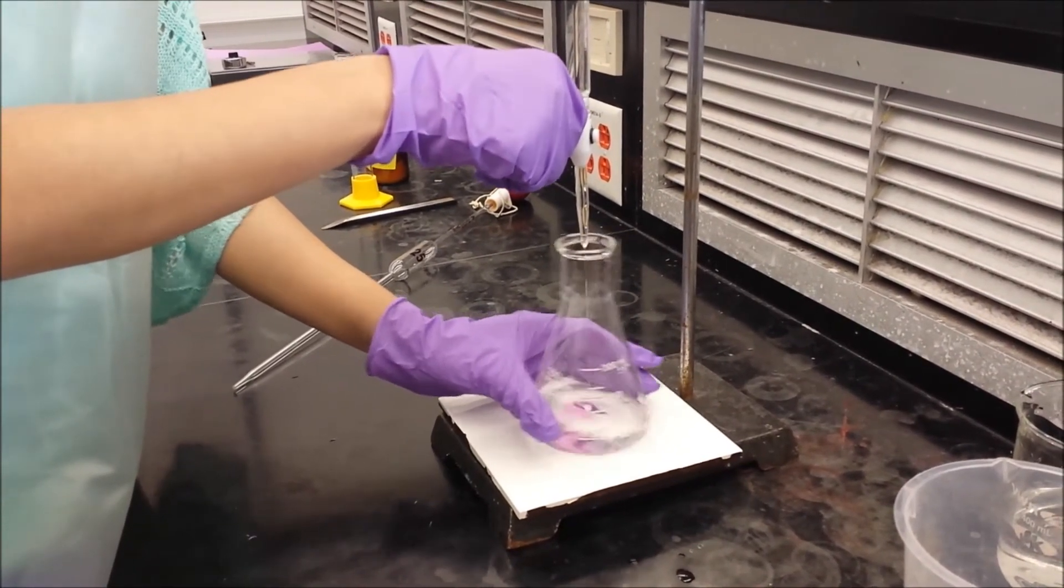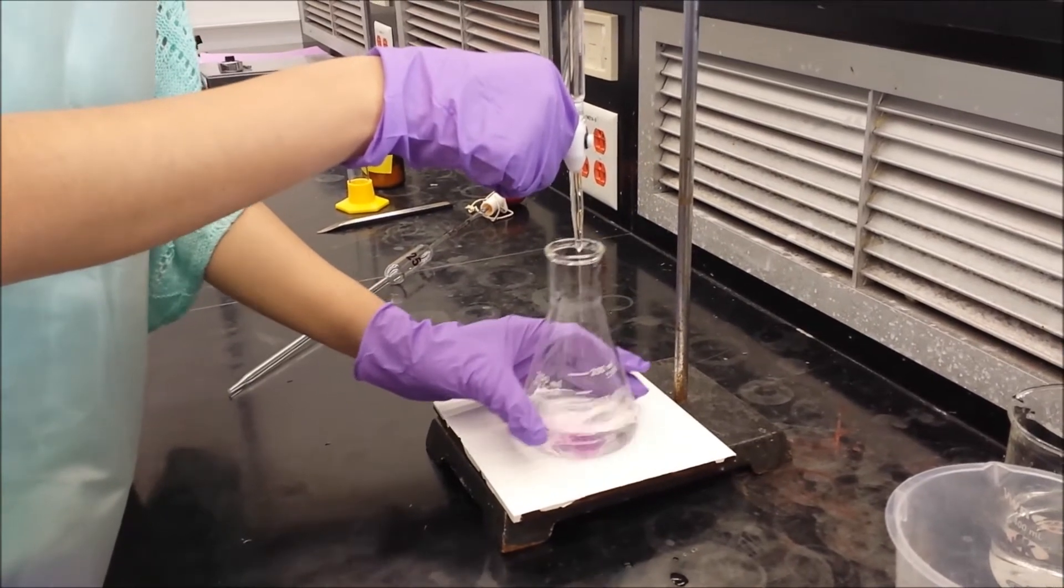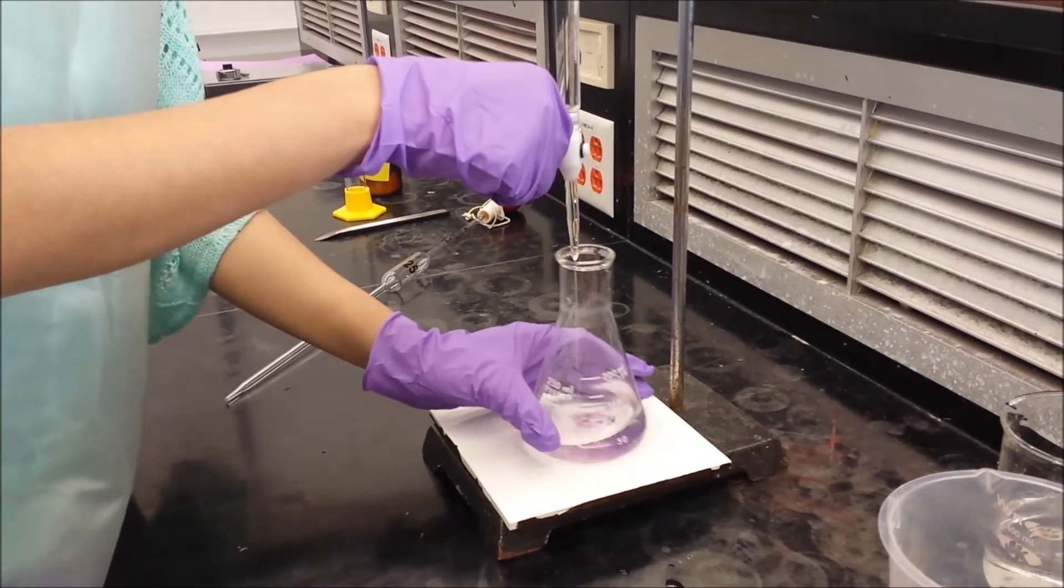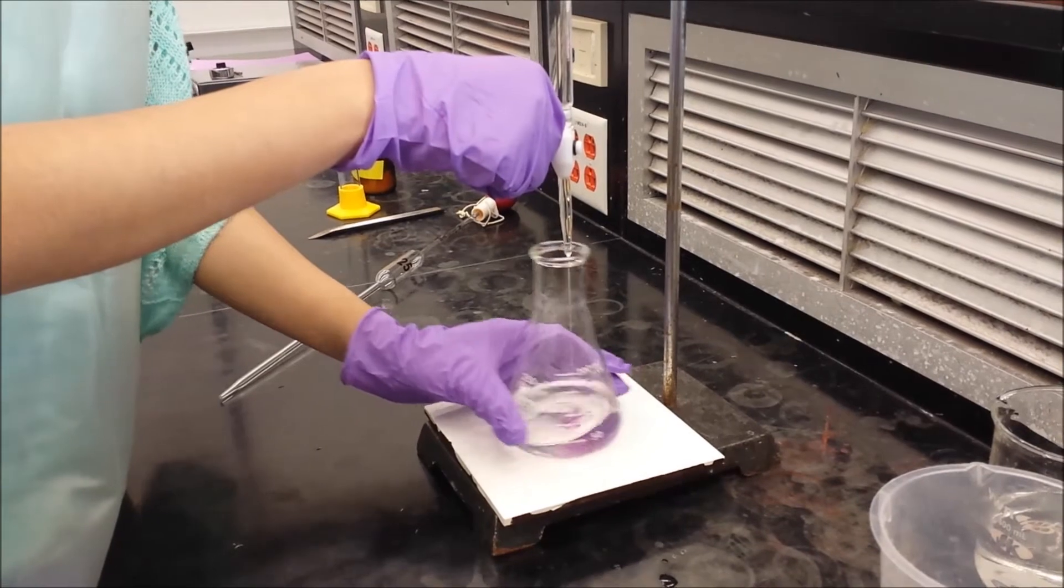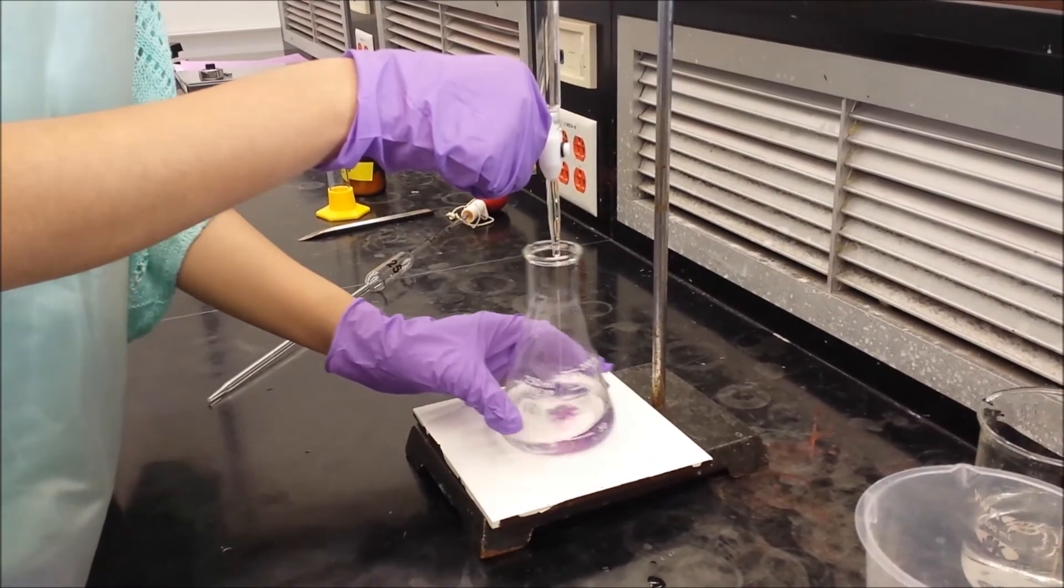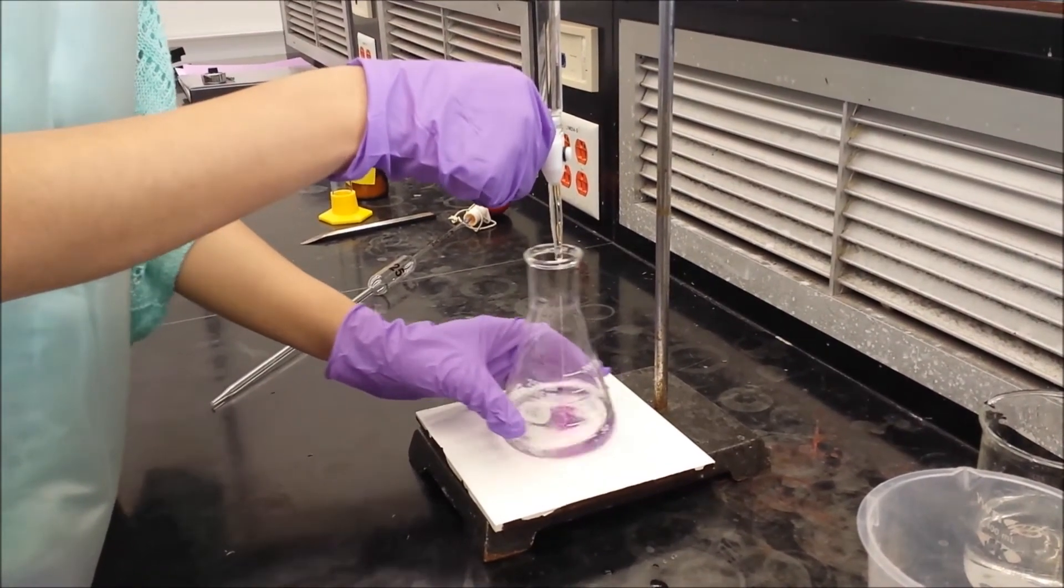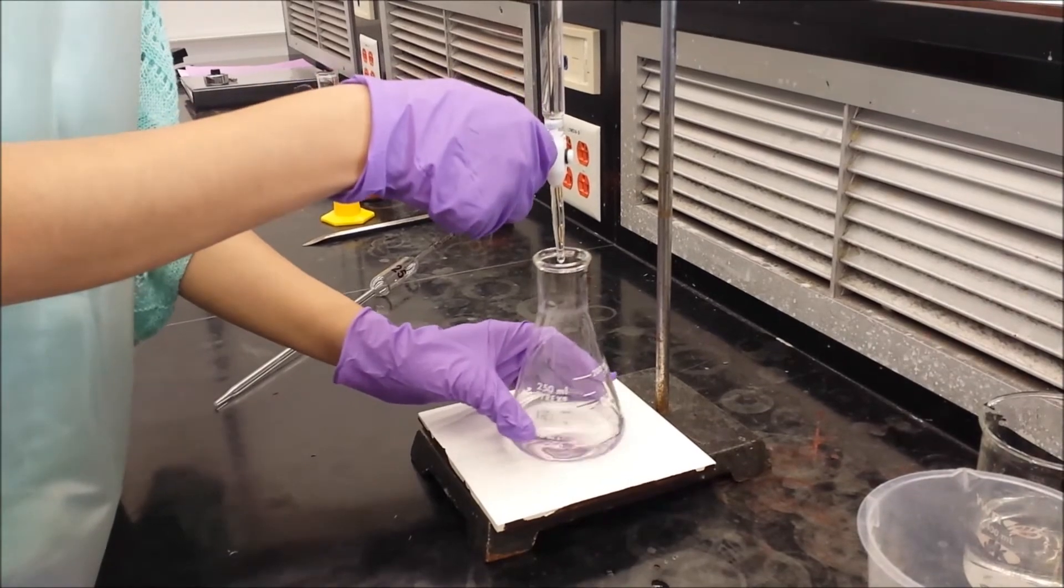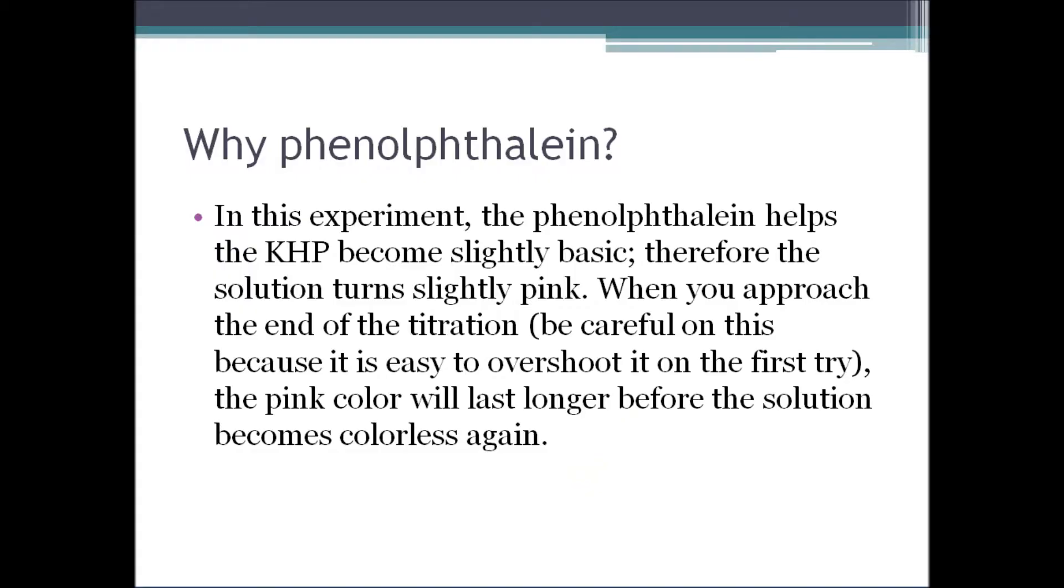As the titration continues, each drop should leave a magenta-pink residue in the flask that should go away when swirling. It is because the phenolphthalein is an indicator, it shows the change in color of the liquid based on its pH level. In this experiment, the phenolphthalein helps the KHP become slightly basic. Therefore, the solution turns slightly pink. When you approach the end of titration, the pink color will last longer before the solution becomes colorless again.